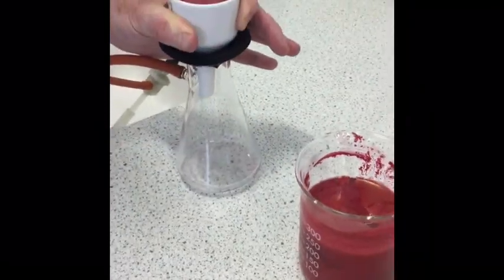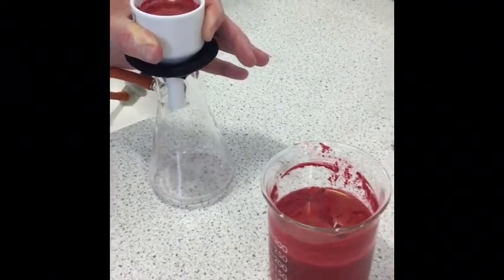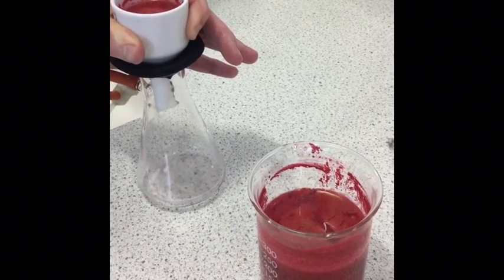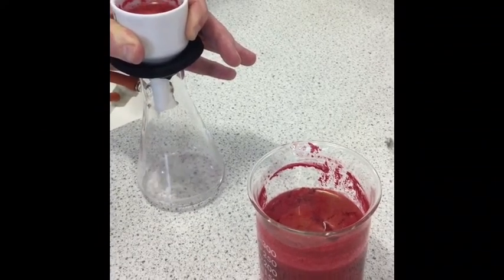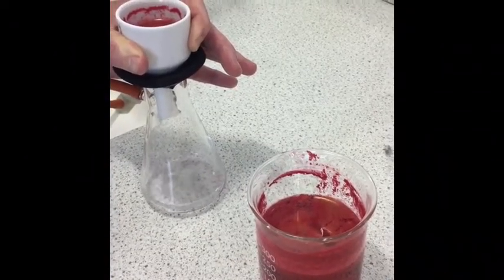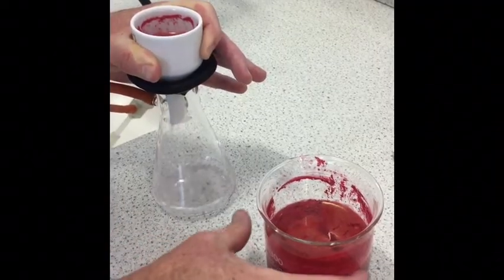And keep on filtering. You can try turning up the tap, but again be careful, because if you turn it up too much it will come off. But it won't ruin the experiment if that happens, so just play with it. I'll pull this in.